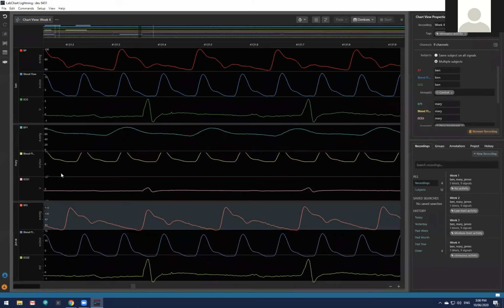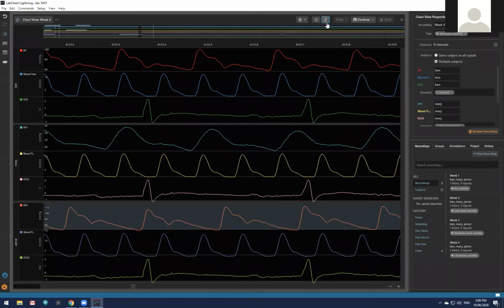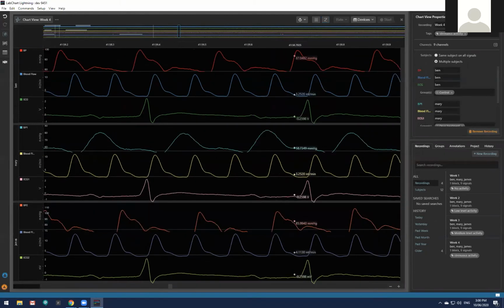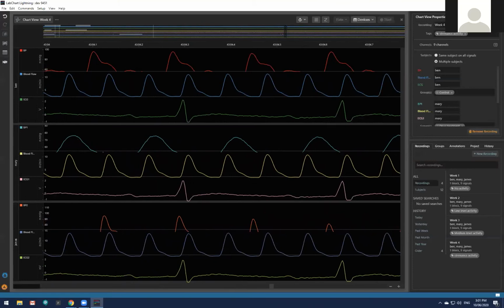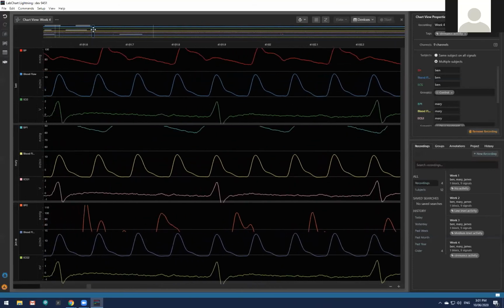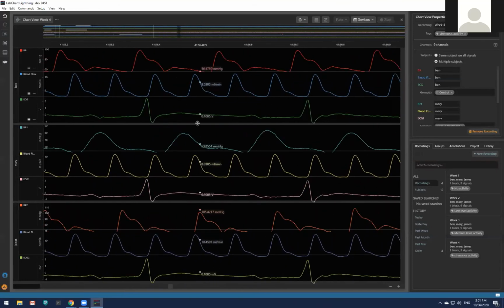And we can just resize this like that. Another good feature we see here is the top here. What does this mean? The colors. This is an overlay of the whole overview of the whole recording. So I can click on any point here and it'll take me to that point in time. Any point here that I want. So that's really an easy thing to do.